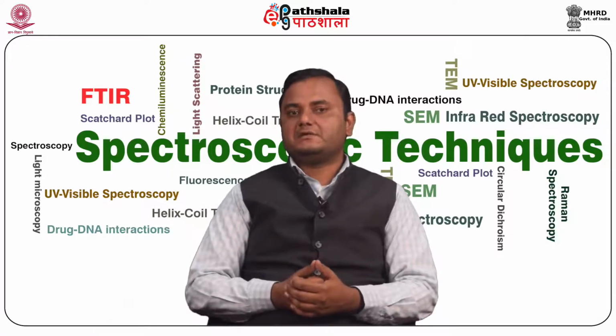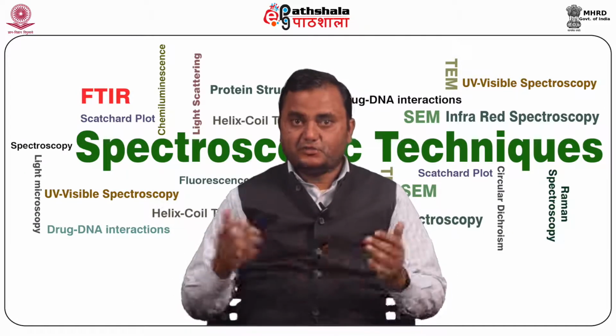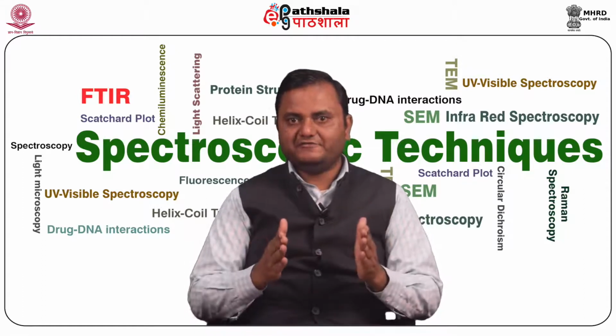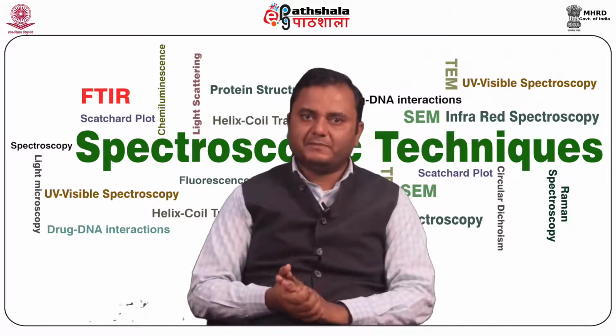Now we discuss some terminology that is mostly used in FTIR, like resolution. The common definition is the separation of various spectral wavelengths, usually defined in terms of wave number.